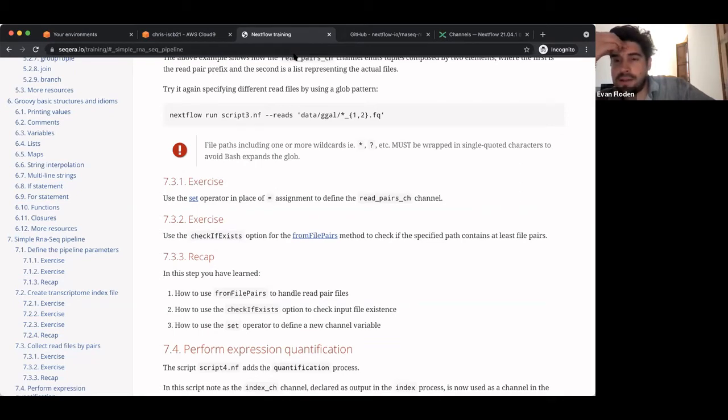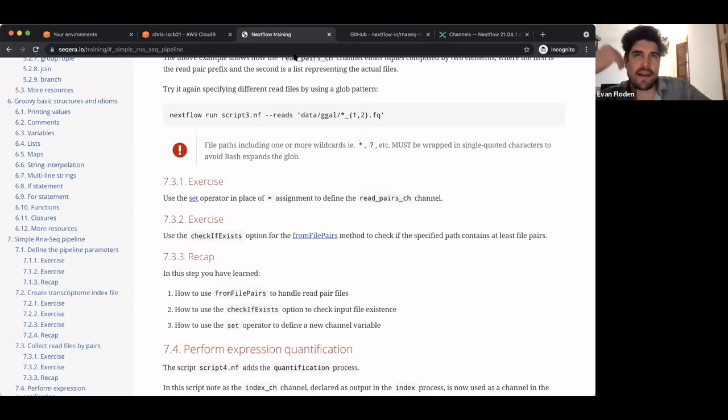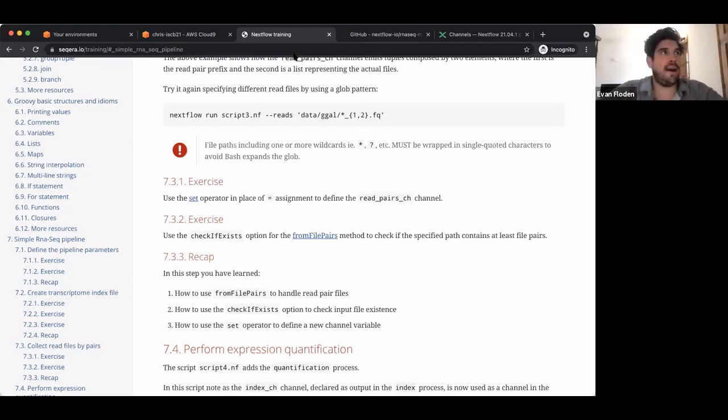Yeah, it's just a minor thing, but I would kind of expect that the 1 and 2 are used to make pairs. So if you have long underscore and then the brackets, that the first items in the tuple would be long and then the underscore, because the underscore would be part of the string belonging to. I see what you mean. Yeah. But it's minor, so if you don't want to bother it. I know what you mean. Maybe Paolo's on the call. He'll be able to chime in for exactly why the underscore is ignored there.